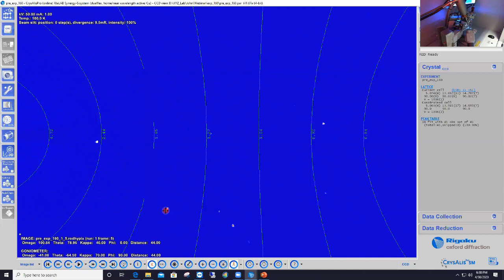So now I'm ready to go back to the strategy interface. I'll explain briefly what that strategy interface shows, and then I'll start the data collection. And that will be basically the last part of our webinar. Before we do that, we'll take a second short break, and Joe is going to ask you a second poll question to ask you what kind of operating system you use. Basically, CrysAlis Pro runs on Windows, but you can still run it on your Mac or Linux computers by installing a virtual Windows machine. So we want to know whether you guys know about that, and what operating system you use on your computer. Go ahead, Joe.